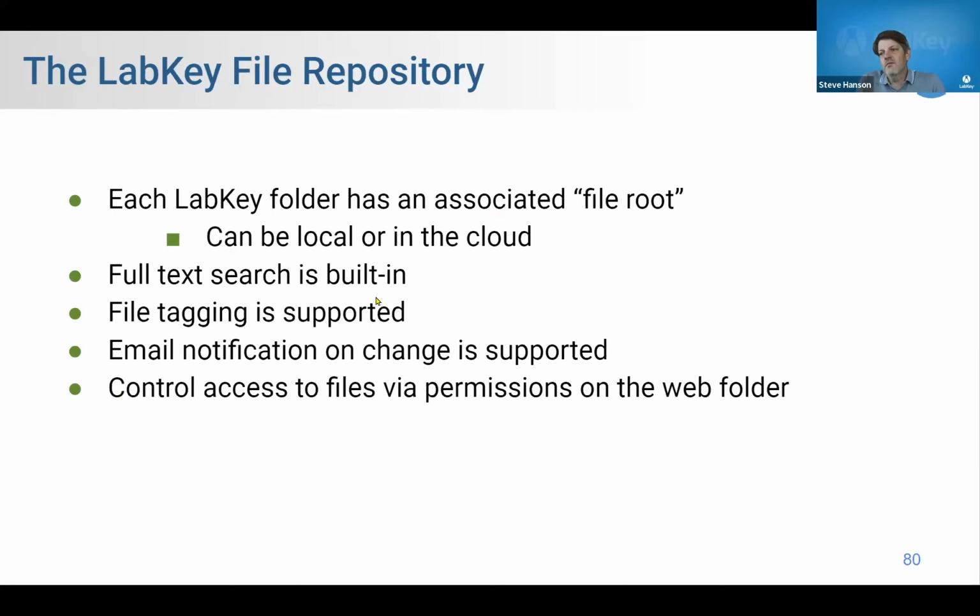The file repository itself, I don't want to spend too much time on it, but to give you a little more detail, you can define this locally, on the machine that LabKey is stored on, or you can also do it in the cloud. Like you can put all your files in an S3 bucket and tell LabKey to put them over there.